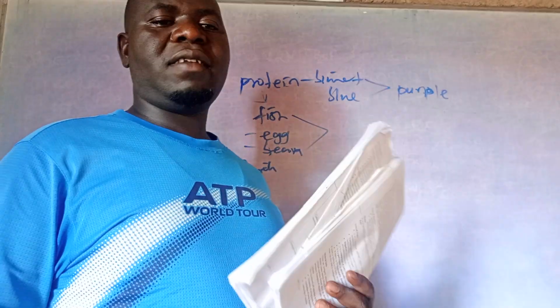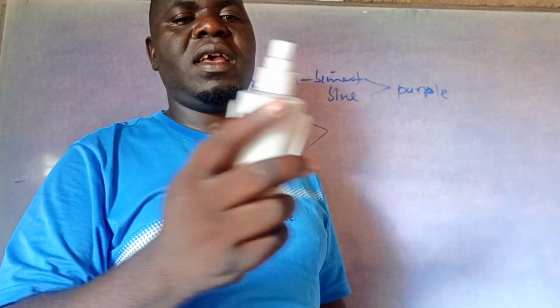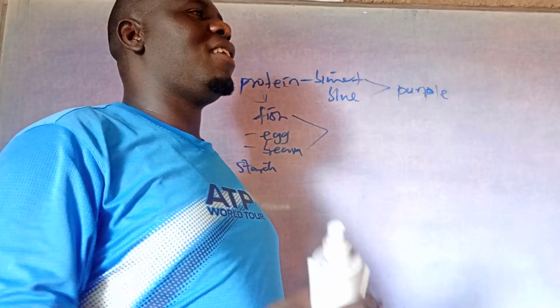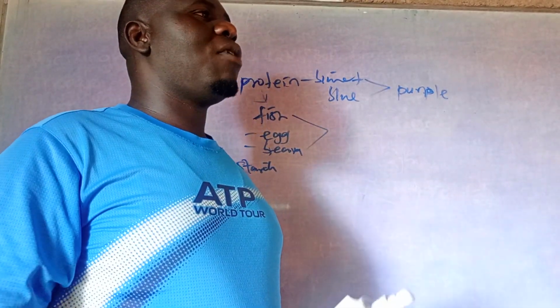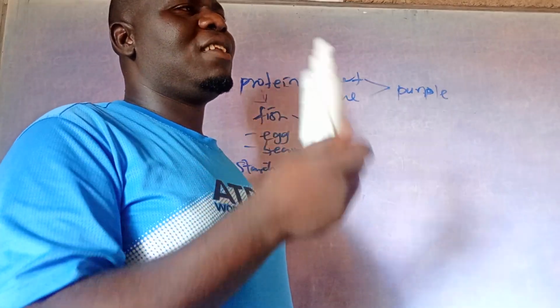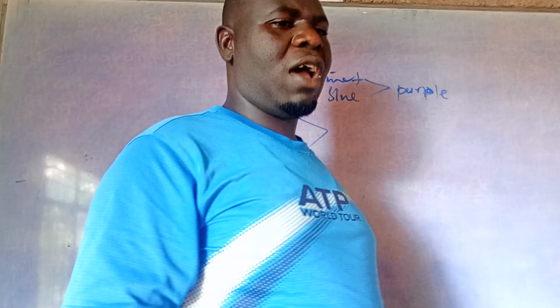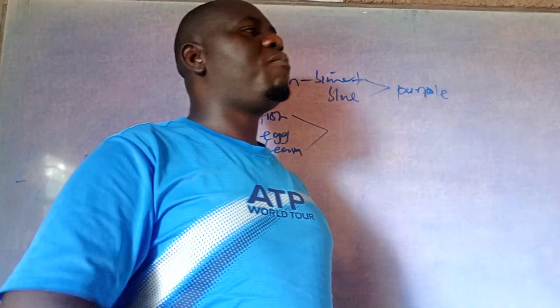We don't say add. For example, when you get this test tube, this test tube is empty. So when you say add, it means there's something already and you are just adding on, right? So the test tube that you are getting, is it empty or is there something already? Empty. So why are you saying add? So put.